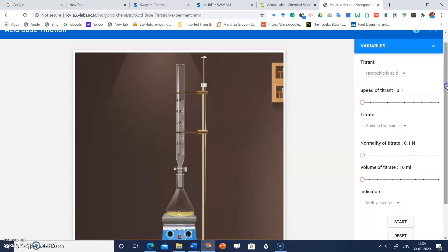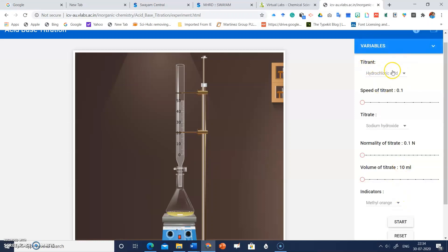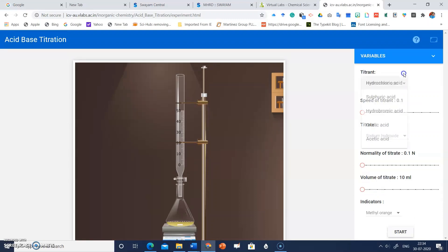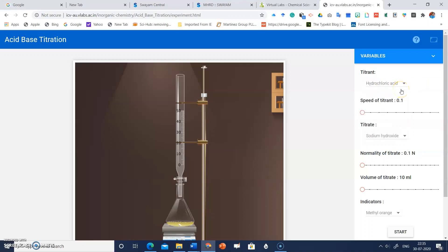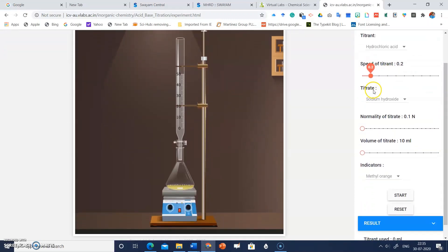On the extreme right of this window there are options. Click on 'Variables.' Here you can choose the titrant — for example, hydrochloric acid, sulfuric acid, oxalic acid, or acetic acid. I'll choose hydrochloric acid. You can also adjust the speed of the titrant; the default is 0.1 ml, and you can increase it to 0.2 or 0.3 ml.